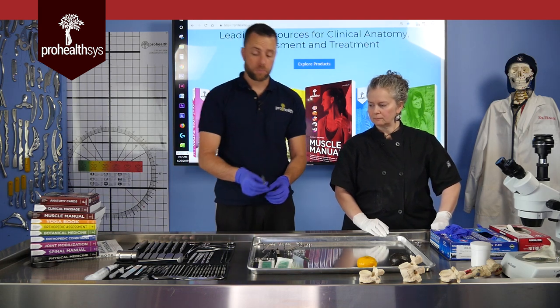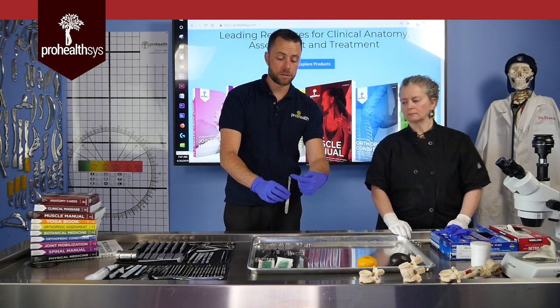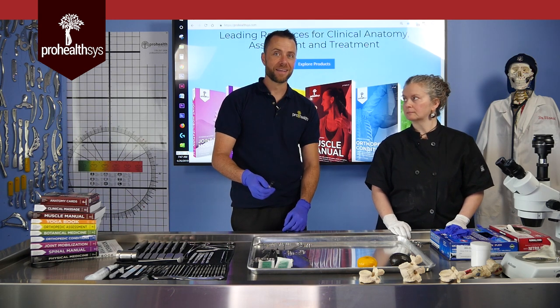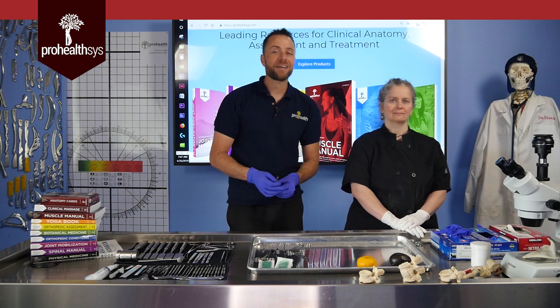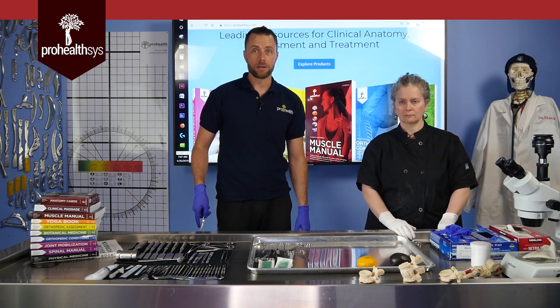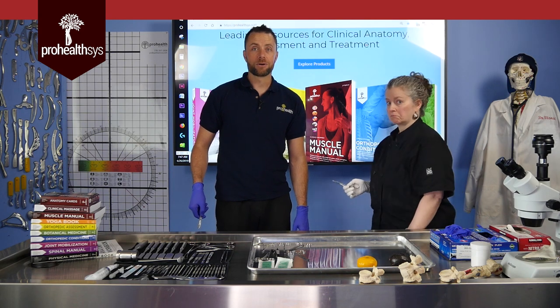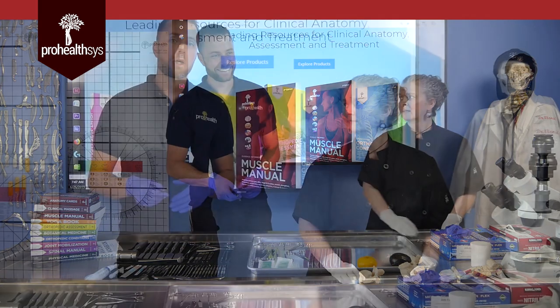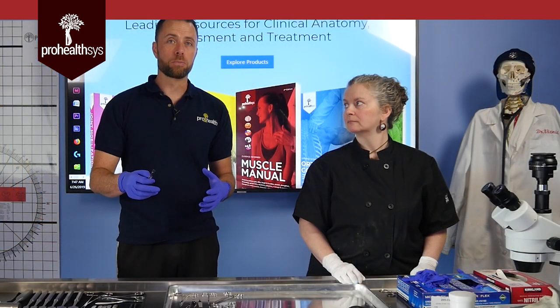A couple of key things. Number one: picking up a scalpel — this is the handle, this is the blade, please pick it up by the handle. Number two: carrying the scalpel — the key thing is scalpel blade is down when you are walking. You don't want to be talking with a scalpel blade in your hand; people will be very excited in the lab, moving their hands around, and that's dangerous to the person beside you.